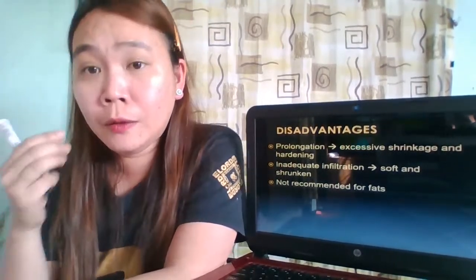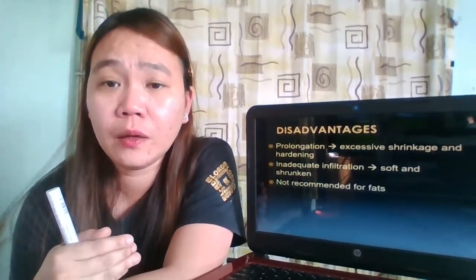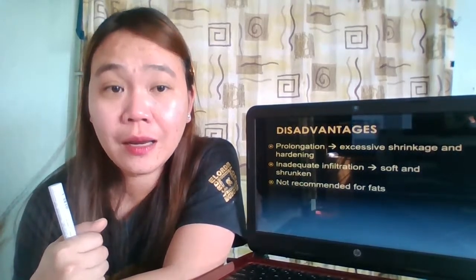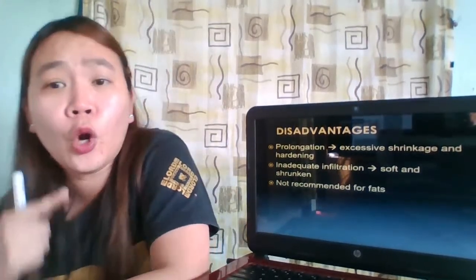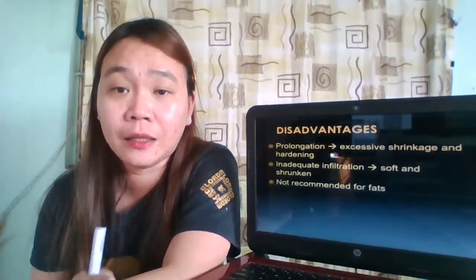Whether we are talking about your fixative, your dehydrating agent, your clearing agent, and now your paraffin. Basta, prolonged immersion in your reagent will result to shrinkage and hardening.